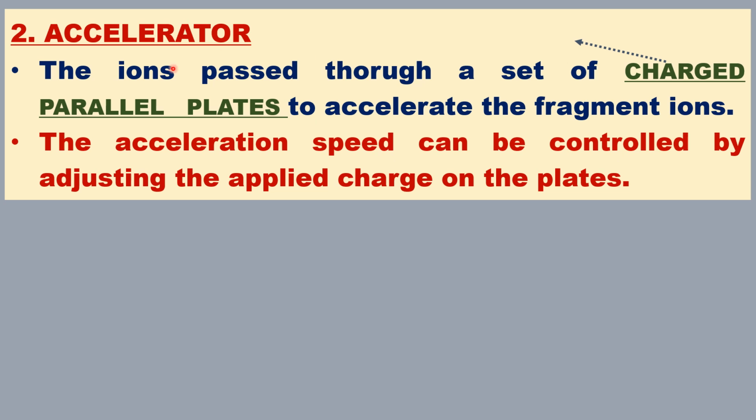Now let us see the accelerator. What is its role in mass spectrometry instrumentation? The accelerator consists of several electrically charged parallel plates.